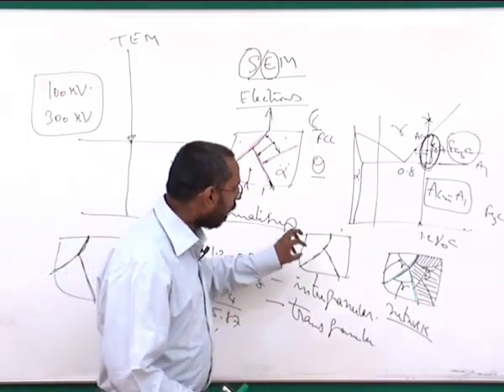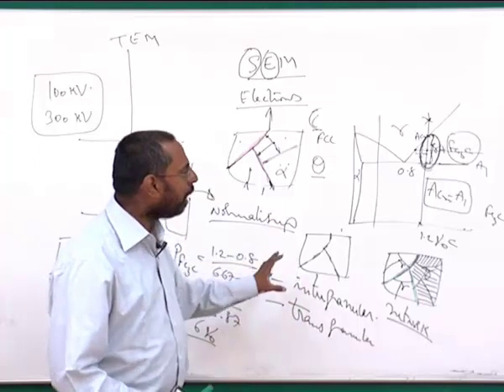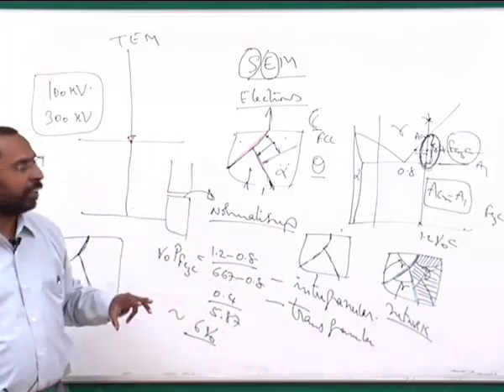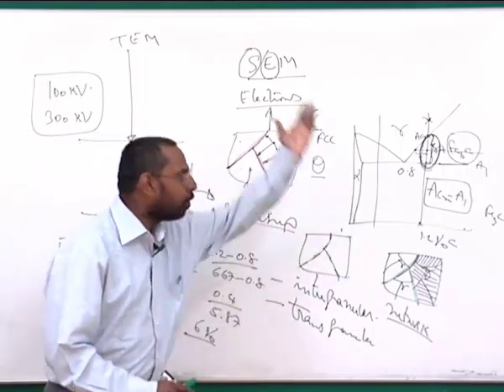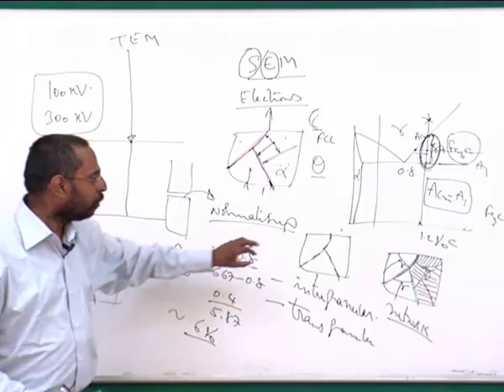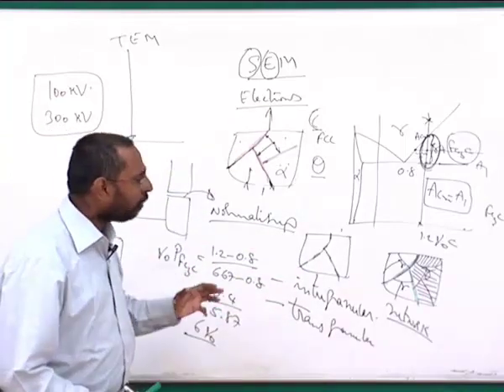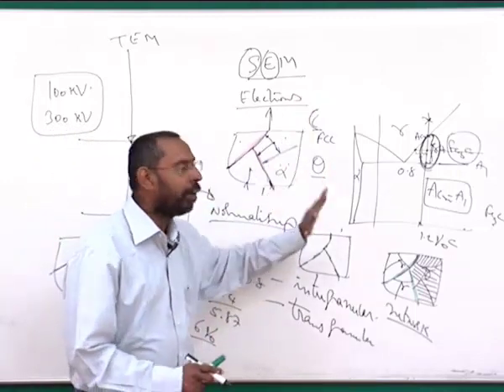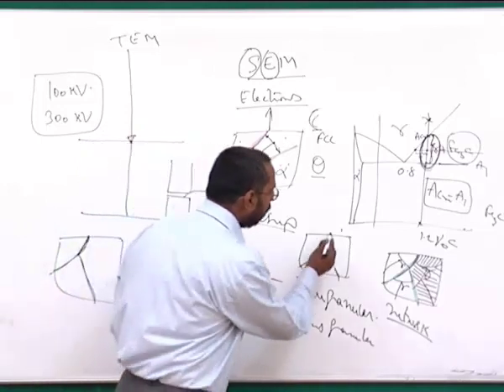As a result, the amount of cementite that can form at the grain boundary is smaller than what it can form during annealing. So that is another advantage for us, because all the cementite is not coming out to form a continuous network. So you will have a smaller amount of cementite coming out because of the faster cooling, and also because the time available is smaller, it does not grow along the grain boundaries. So finally what we see is a discontinuous network.